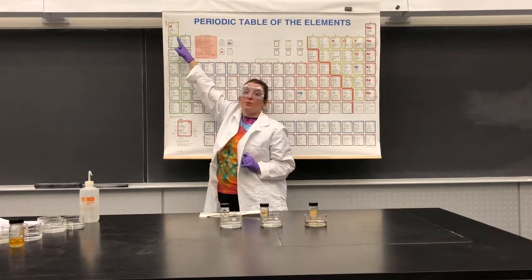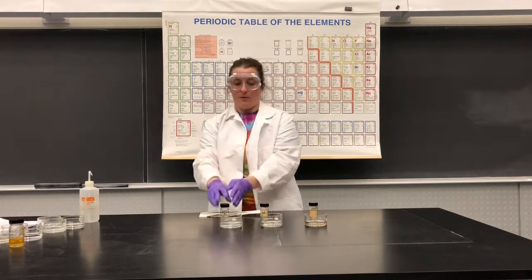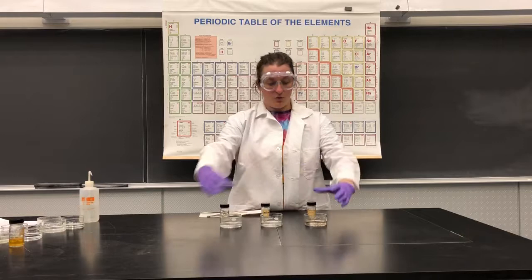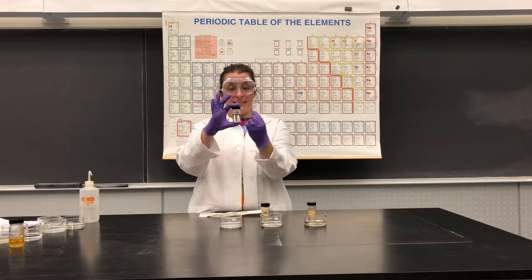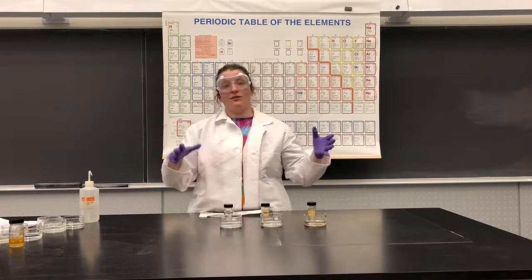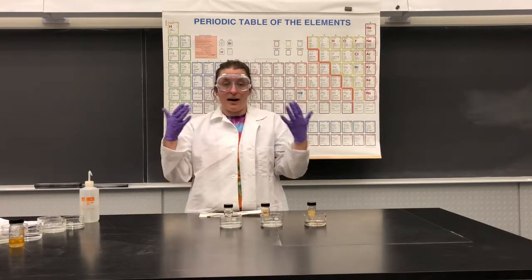We're going to look at what happens when we put lithium, then sodium, then potassium — pure lithium, sodium, potassium — into these little watch glasses with some water. Inside this jar there are little pieces of the pure element, but they're suspended in oil. We need to keep them stored like that so they don't react with water or other things in our air.